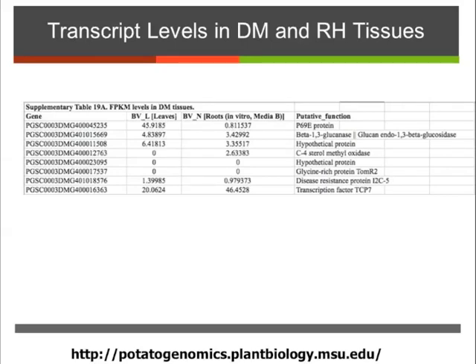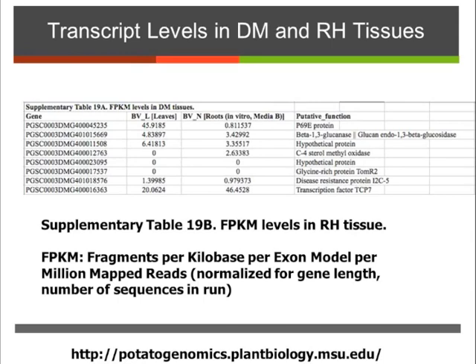One thing that I think is important: the easiest way for us to provide the transcript levels to you is through an Excel spreadsheet, believe it or not. This is actually in the Nature paper, and if you go onto the Nature site, you can just download Supplemental Table A and B.